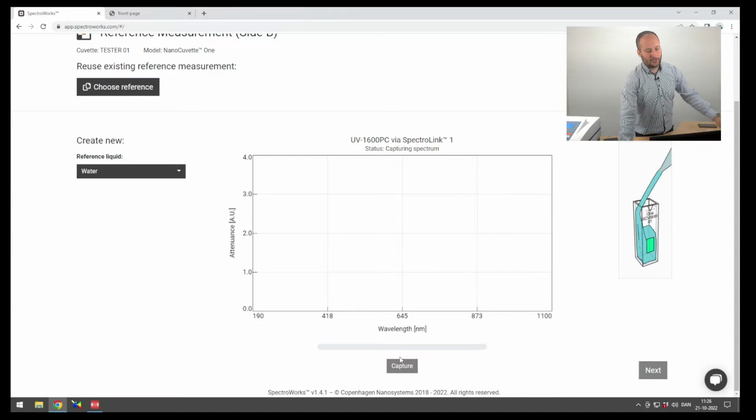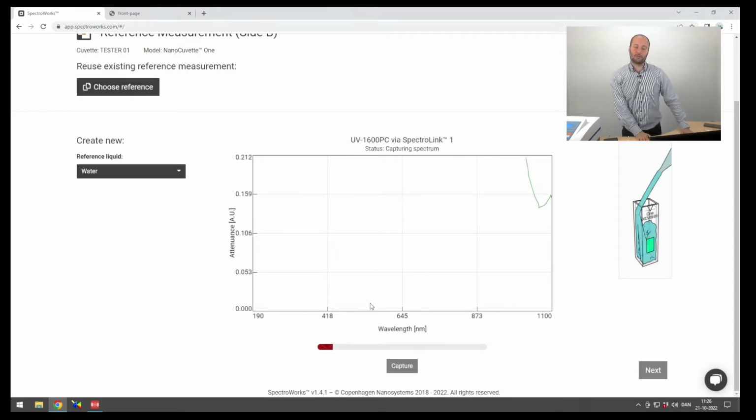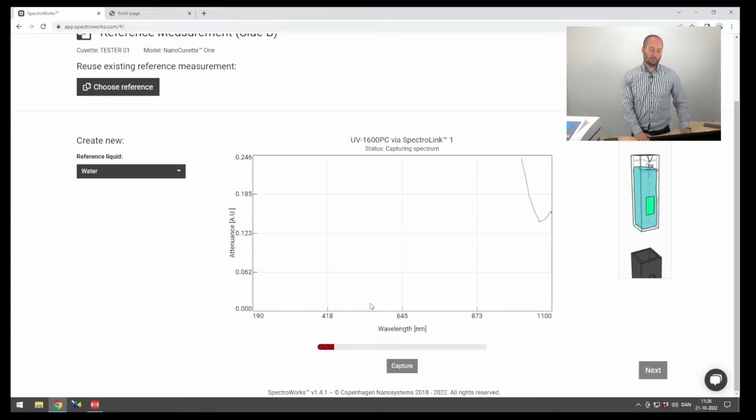So Jade, when we get the resonance now, then you can see the rough wavelength that we can use. And right now you can see the benefit of using Ocean Insight is that because this is a monochromatic instrument with mechanical lenses, it takes a long time to do the scanning with these instruments. So that's of course a clear benefit of Ocean Insight: with a diode array, you get all the wavelengths instantaneously.